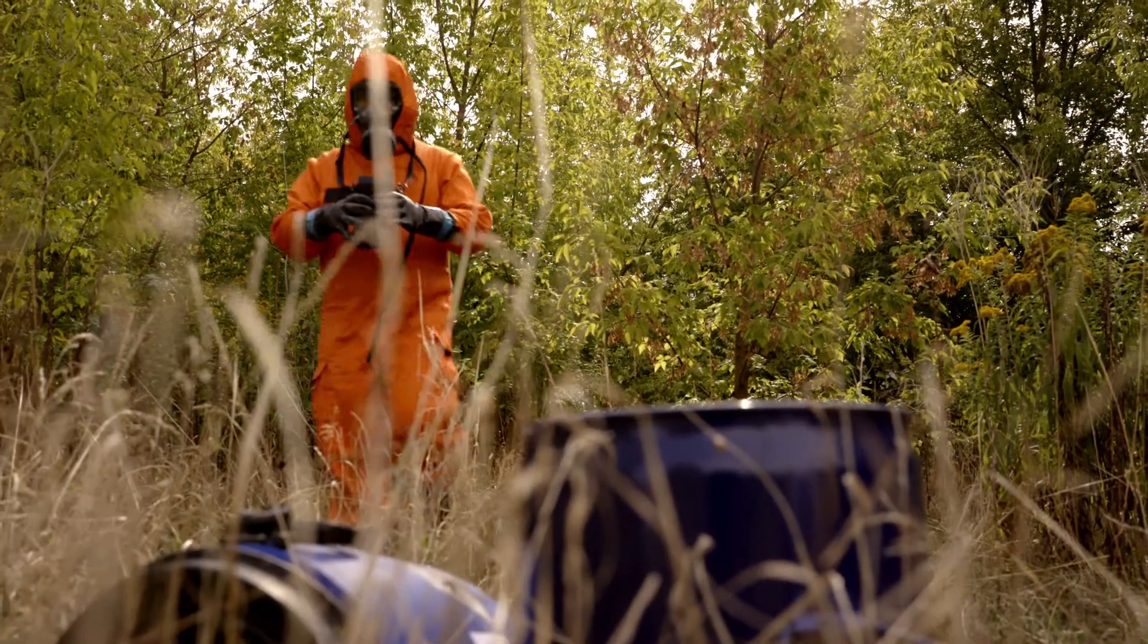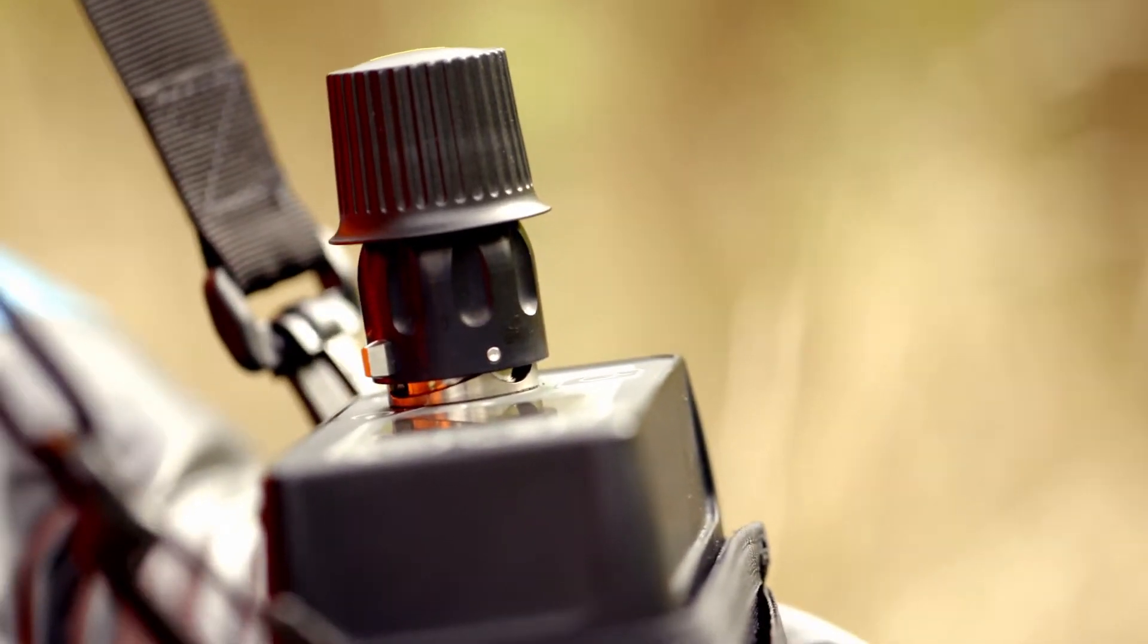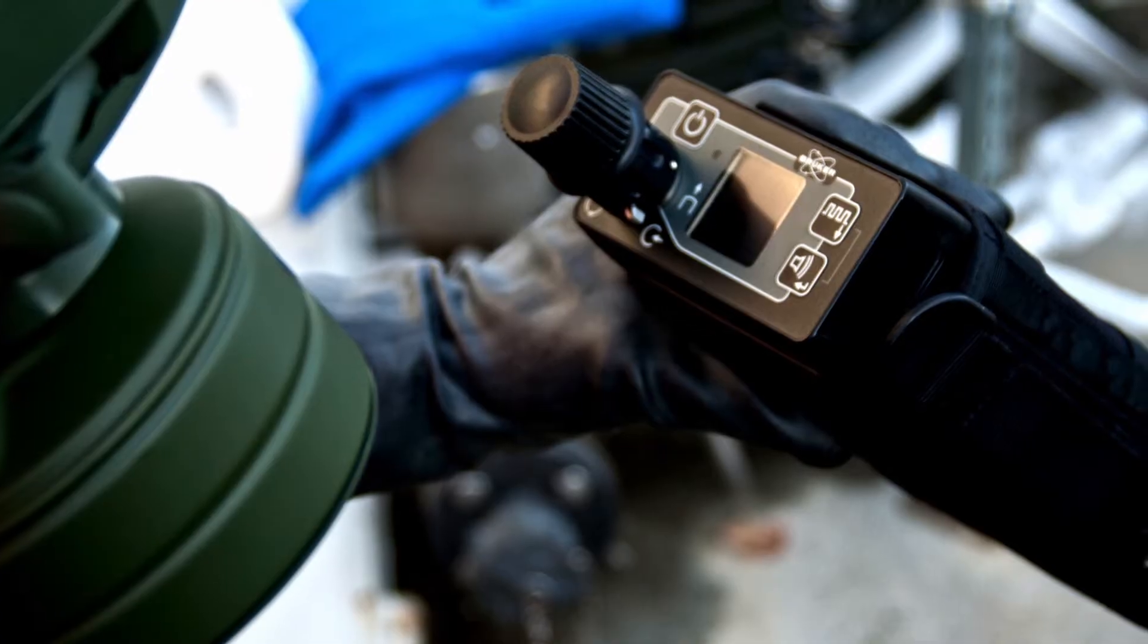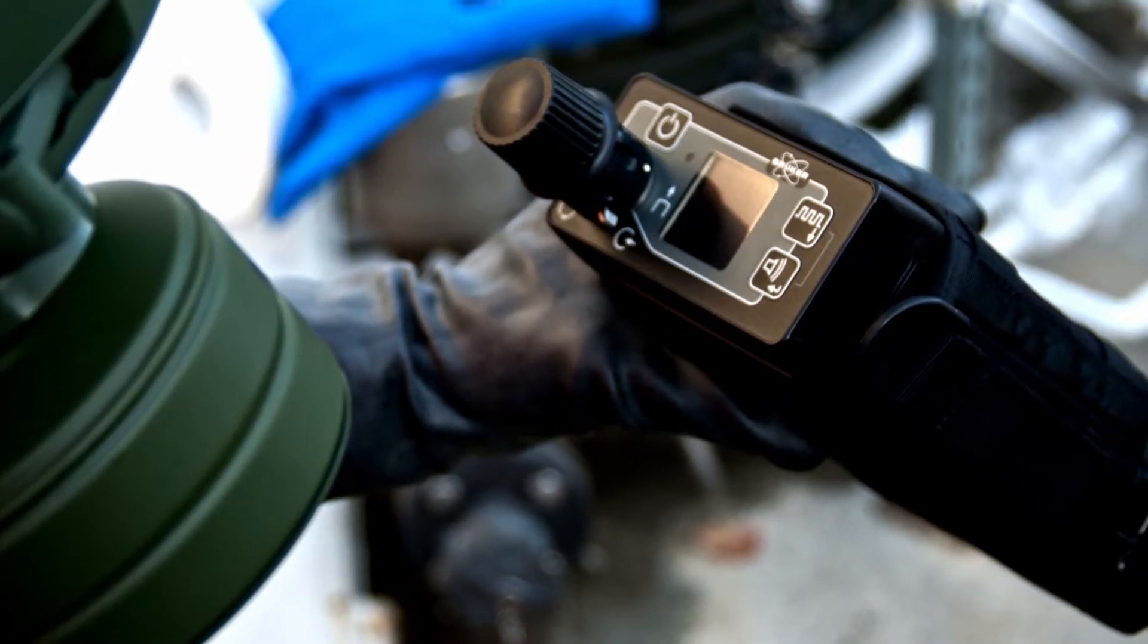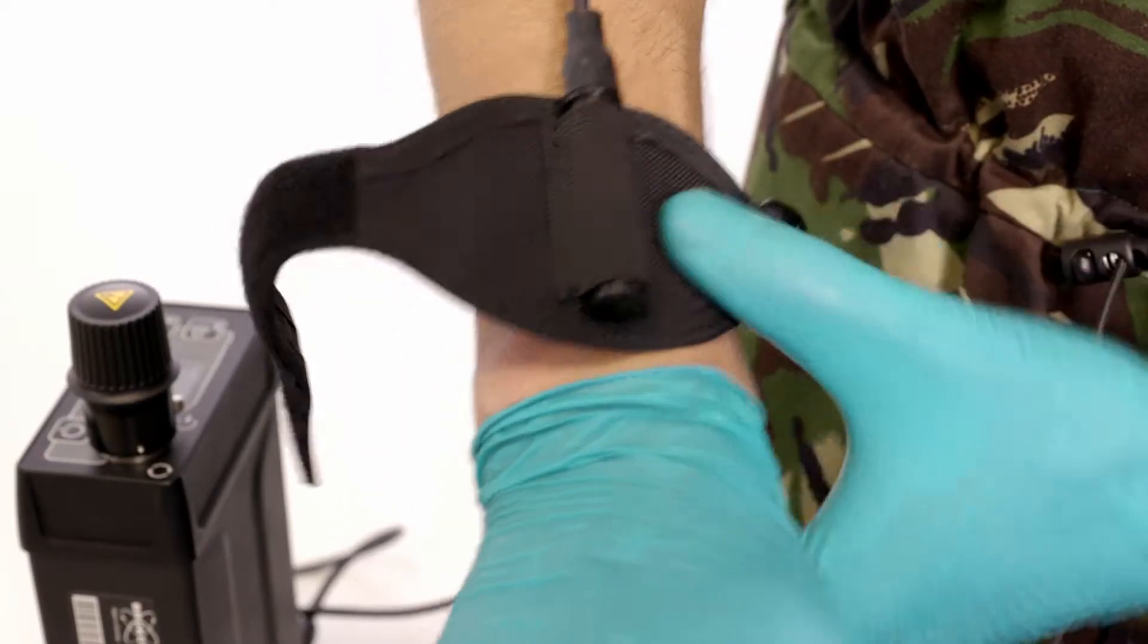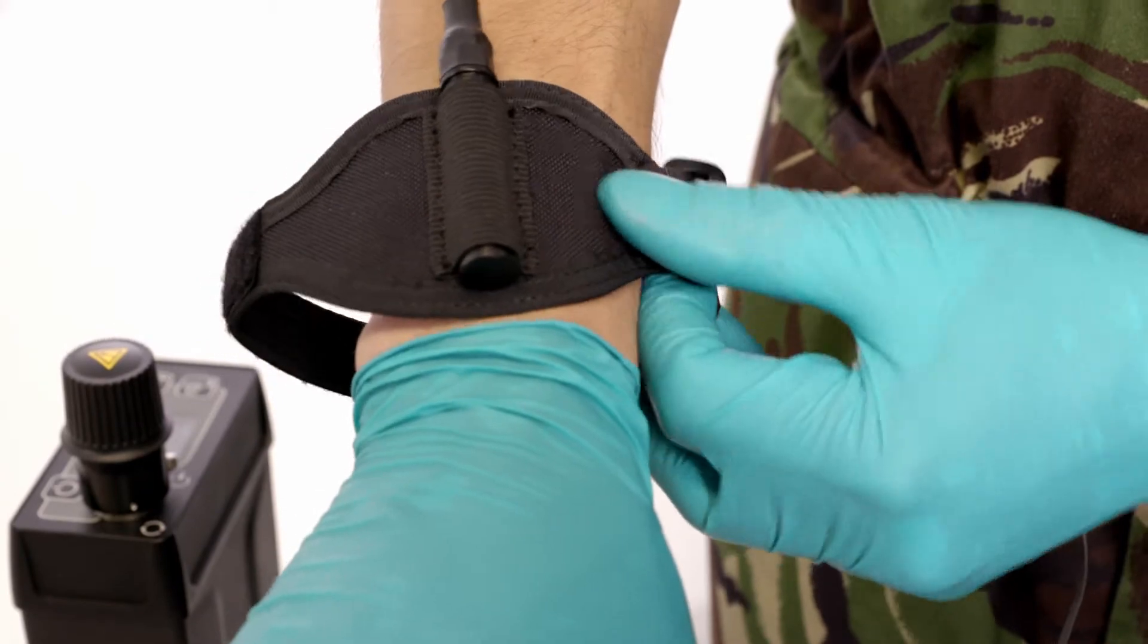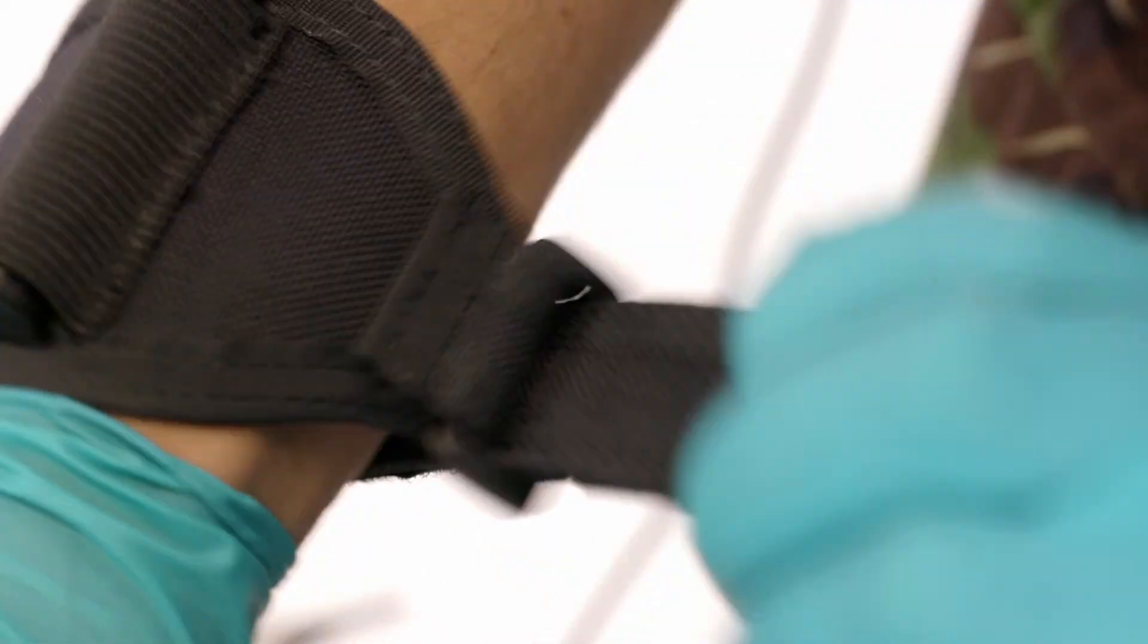MicroRAID Plus is delivered with accessories that make life easy for the operator. The supplied carrying pouch is compatible with in-service load carrying systems and IPE.